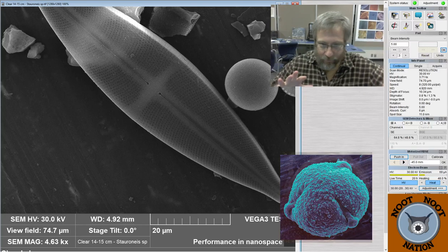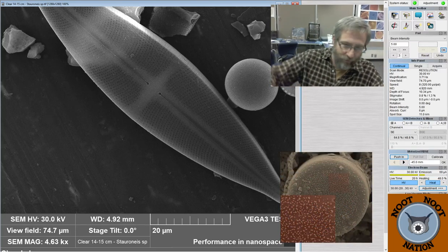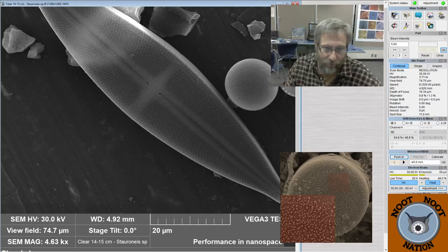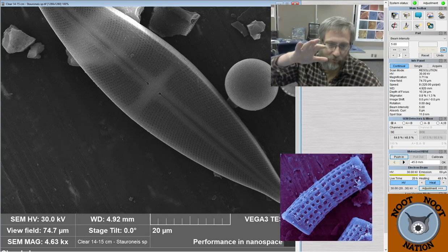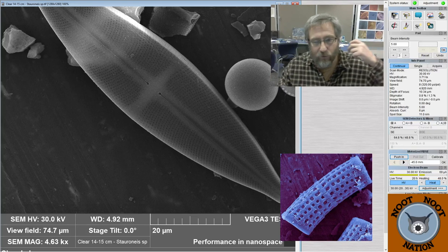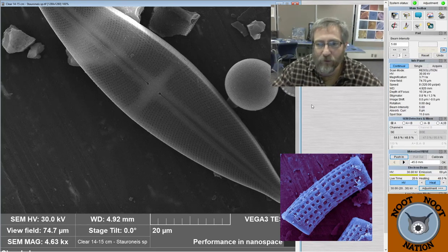I mean, you don't spin it. Or you could also move the camera around the object and take pictures of it in many different positions. But more commonly, people put some sort of rotating stand in the middle that they can turn and then just take pictures and move the angle of the camera. So that's basically what the SEM is doing.